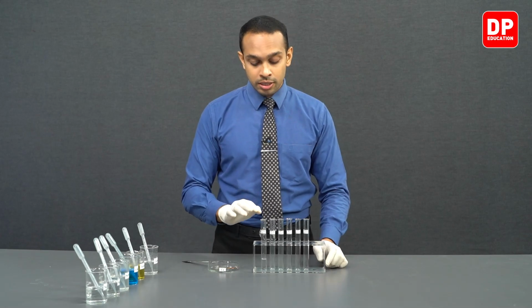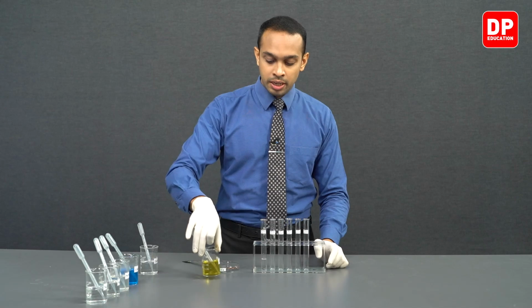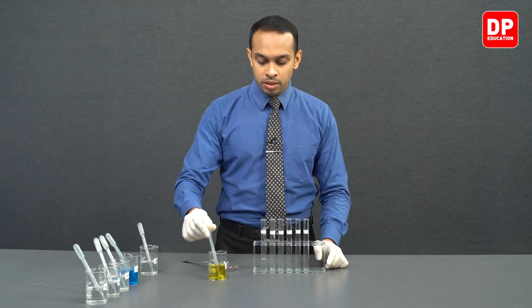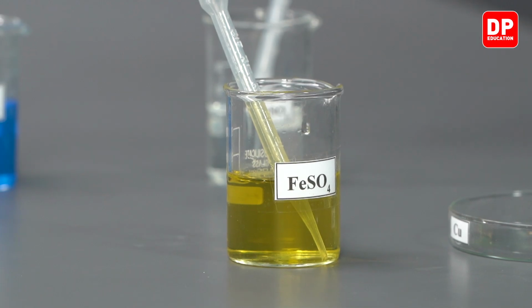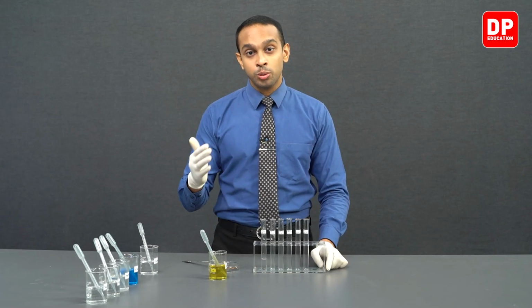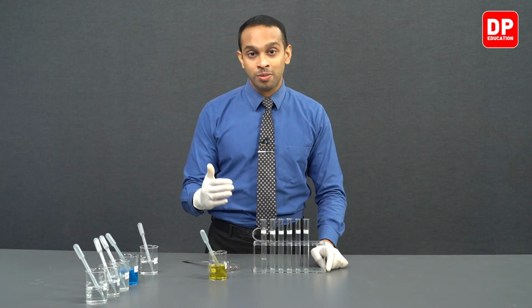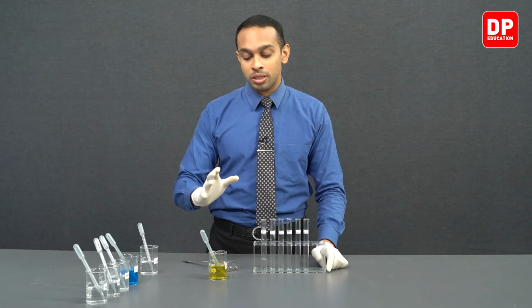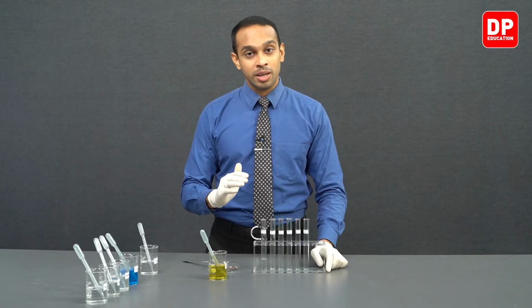And then to the test tube labeled Fe2+ ions, we will take our ferrous sulfate solution. Ferrous sulfate, students, as soon as you prepare the solution, will appear a pale green or blue-green color. But as you allow it to stand in air, it will gradually get oxidized to form Fe3+ ions. So the solution might change its color a little bit. So keep that in mind.